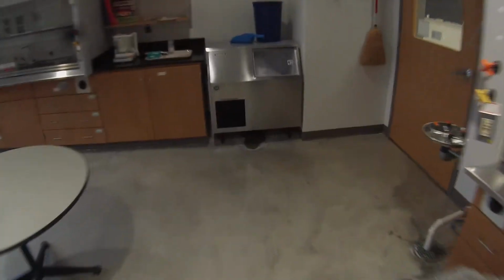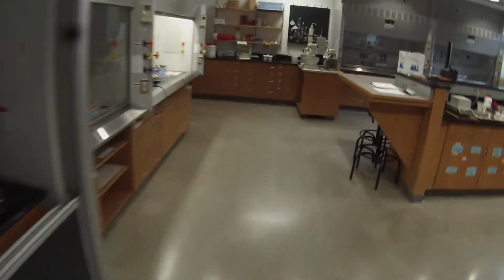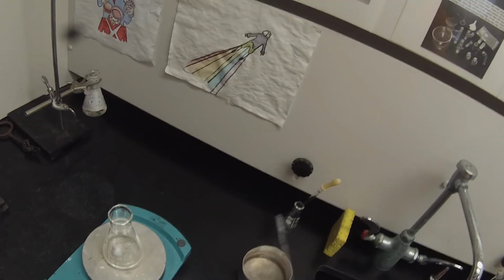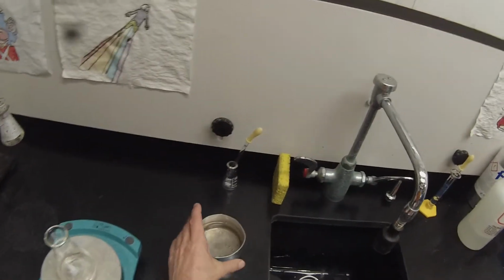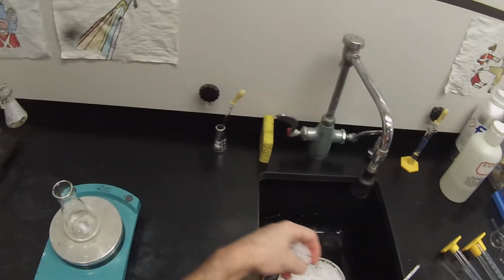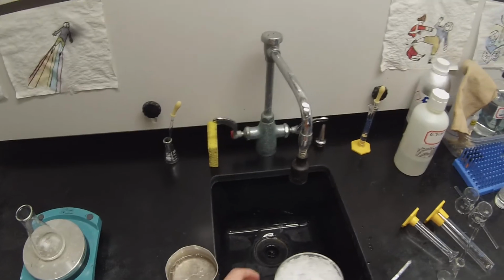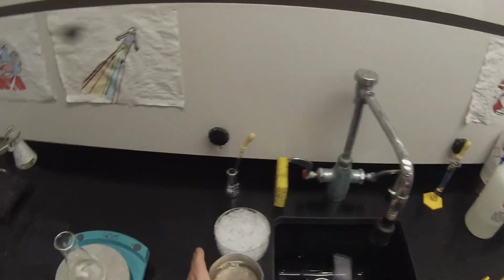And we're going to need that ice bath again, so I'll go get some more ice. It's a pretty common technique in organic chemistry to start a reaction off at a very low temperature, because it'll be a little exothermic as the reaction starts, and then gradually allow it to warm to room temperature over time. Add a little bit more ice to this ice water bath that we're going to use to rinse our acetanilide after filtration. And we'll just leave those sit so they're ready when we need them.